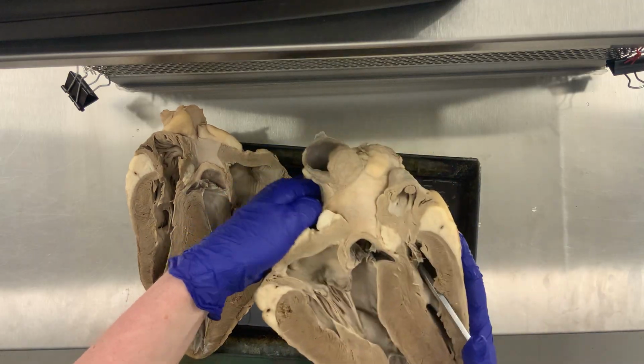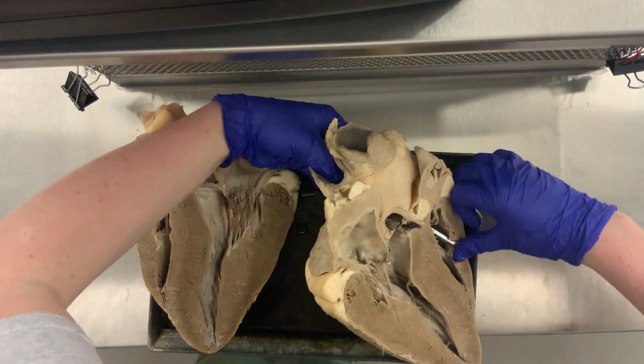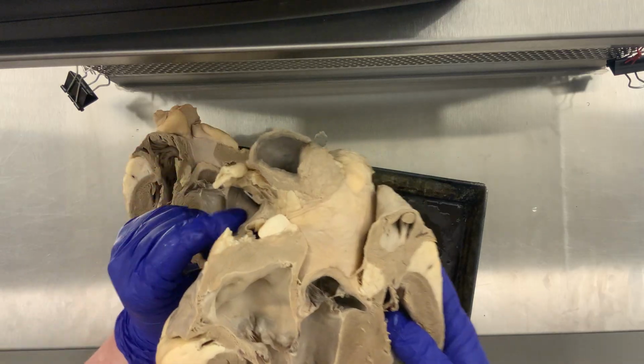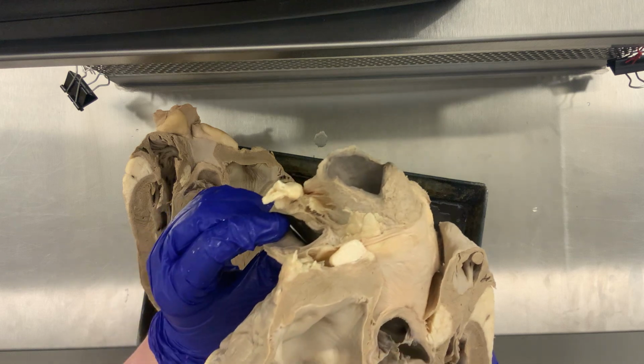I'm sticking my fingers down. Not get the blunt probe all the way through to show where it comes through. So as you can see, it's coming from here and coming out in here. So this is going to be the pulmonary trunk.